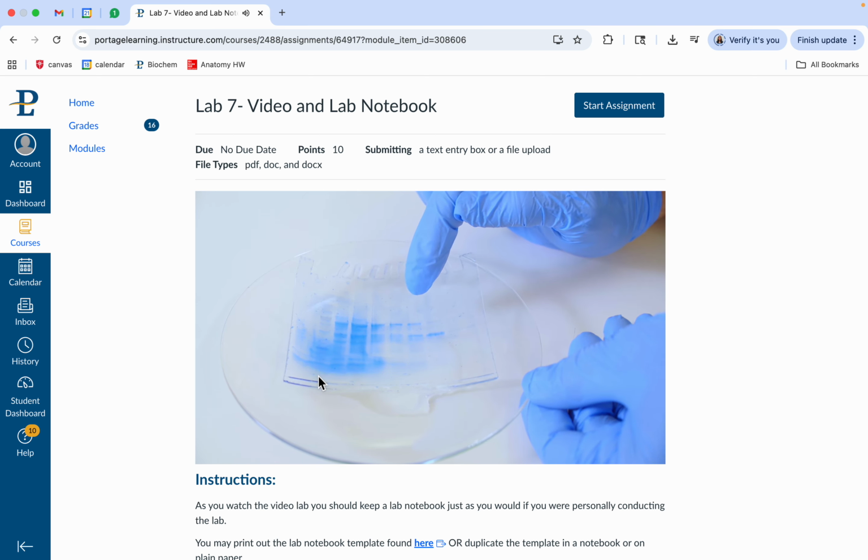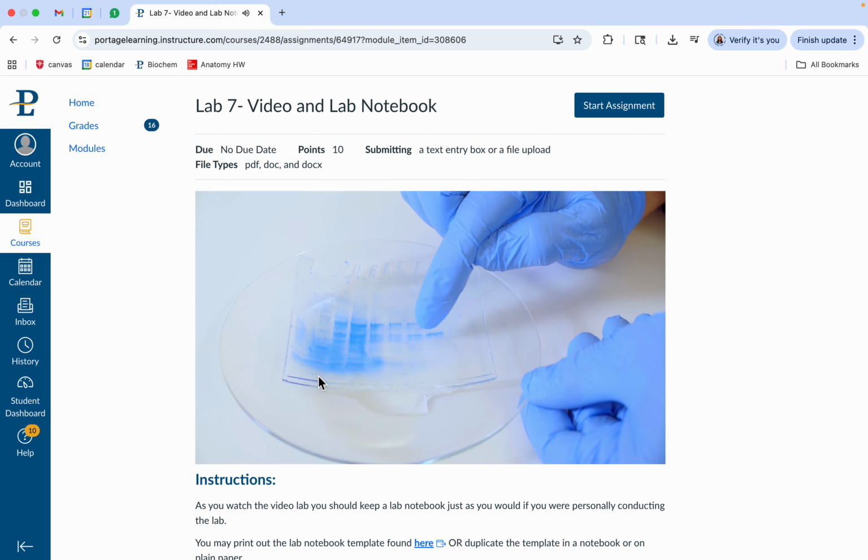And then our final step was after the CM column, and so this is tubes 26 and 27, and I ran the tubes at 2 different concentrations. But the thing you'll notice is that the brightest band really is this one at 45, and the other bands are lighter. There is this one, which means there's some sort of contaminant sticking around.